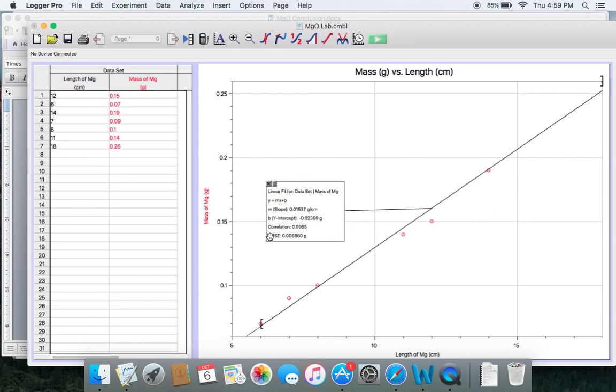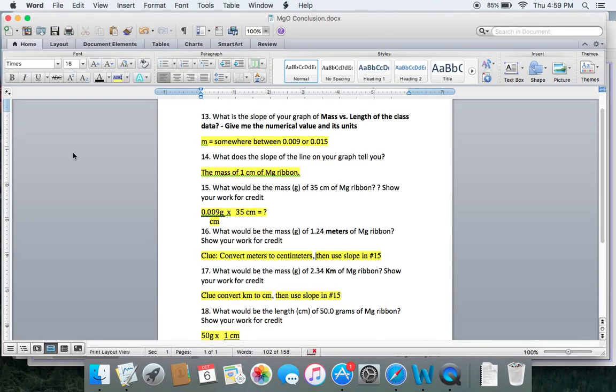My slope is 0.015, which is okay. You're going to get somewhere between 0.009 or 0.015.